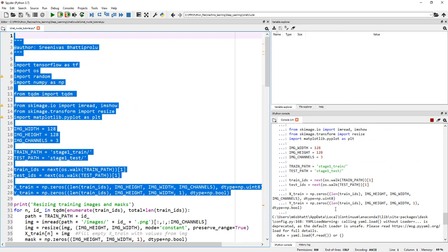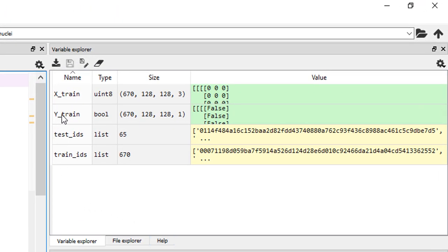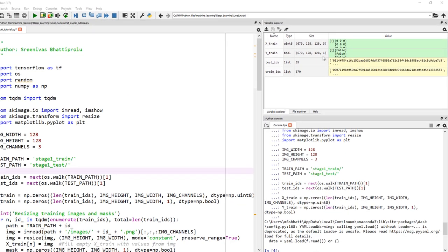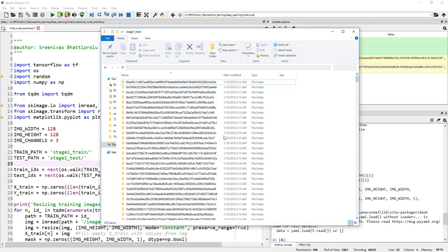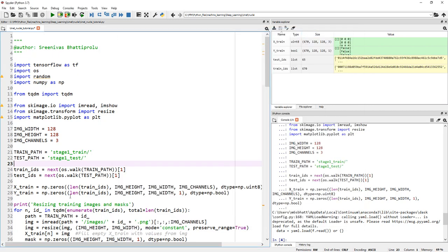There you go. X_train is unsigned integer 8 of size 670 by 128 by 128 by 3. Why 670? We have 670 subfolders in training — 670 images. That's exactly what this is. Y_train is exactly 670 by 128 by 128 by 1 and is of type Boolean.